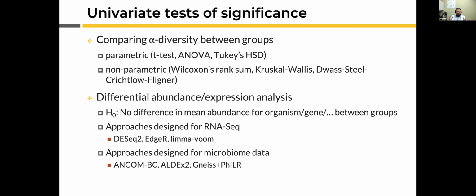So this basically goes back to the assumptions. For RNA-seq data sets, you typically don't have that many zeros, but for microbiome data, your data set is often what's called zero inflated. You have some higher proportion, 30, 40, 60% of your table, that is going to be made up of zeros. Now, that's not always the case, and there are ways to look at the level of zero inflation, and there are measures to mitigate zero inflation.